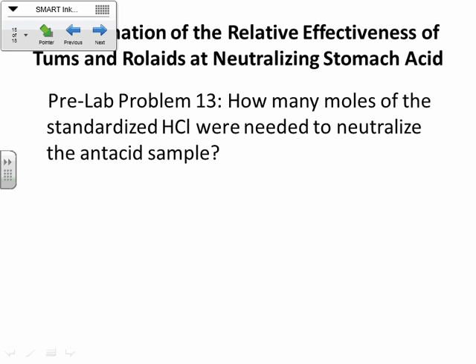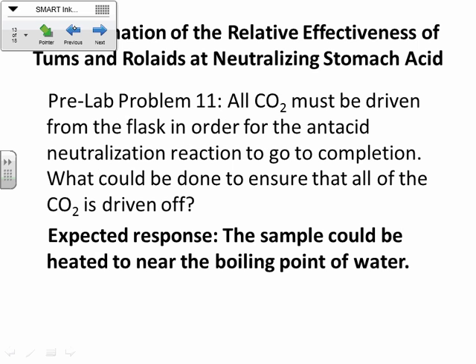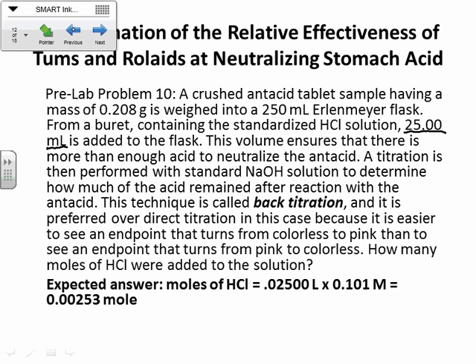How many moles of standardized HCl were needed to neutralize the antacid sample? Okay, so this is a little tricky here, but if we look back at our last two answers, it took 0.00253 moles of HCl, or that's how many we added total, right? And then we can figure out, I need to write that number down, I'm going to forget it.